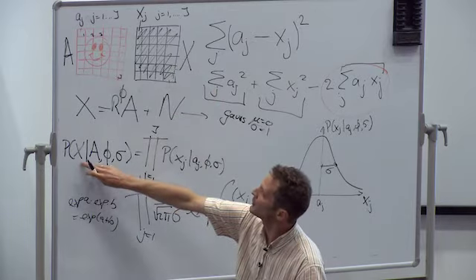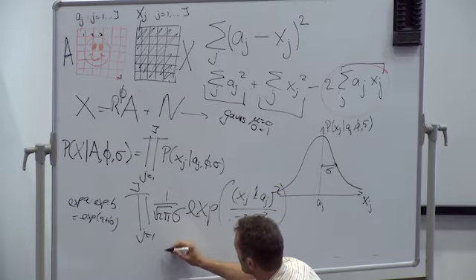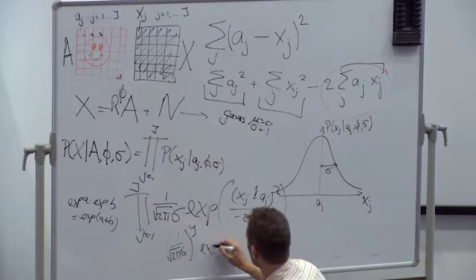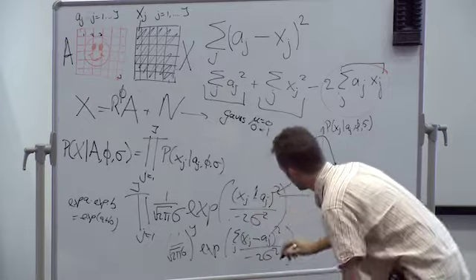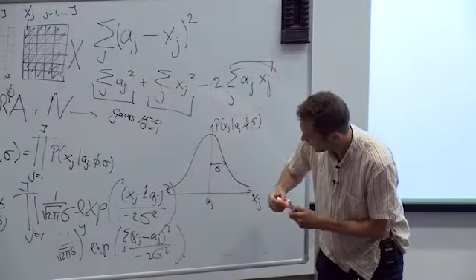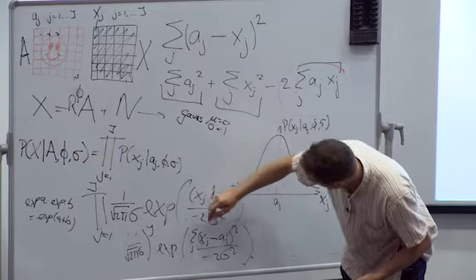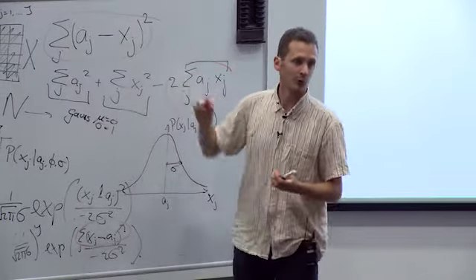So the probability of observing an image given the reference in that orientation, with some rotation there, would then become something like this, where the multiplication becomes a sum inside the exponent. So the probability of observing the image given this reference image contains the exact same least squares term that we were also optimizing in the maximum cross-correlation approach.